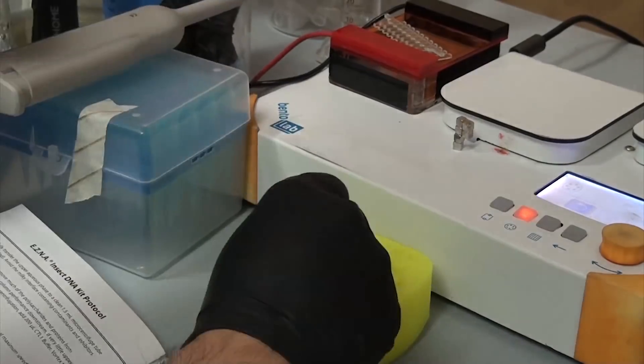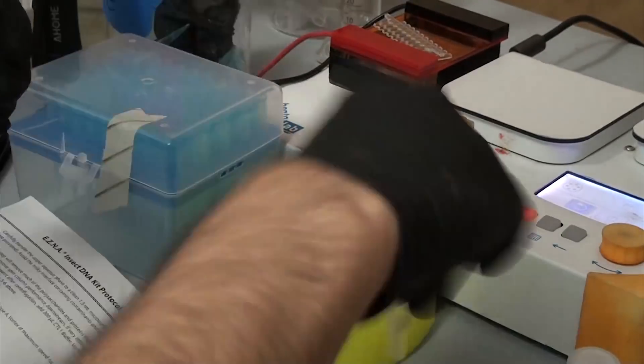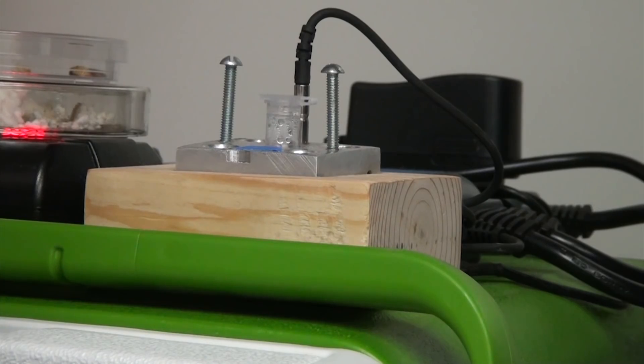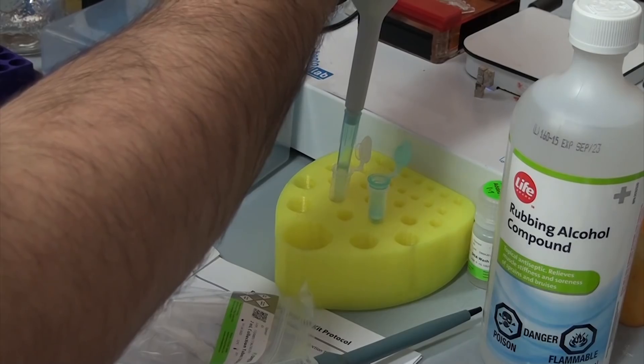To our now clean solution, we add some RNAse-A and HBC buffer and incubate at 70 degrees Celsius for 10 minutes. This will destroy any RNA while also deactivating any proteins that stuck around. Then we add ethanol before loading it into the same sort of filter and tube setup as before.